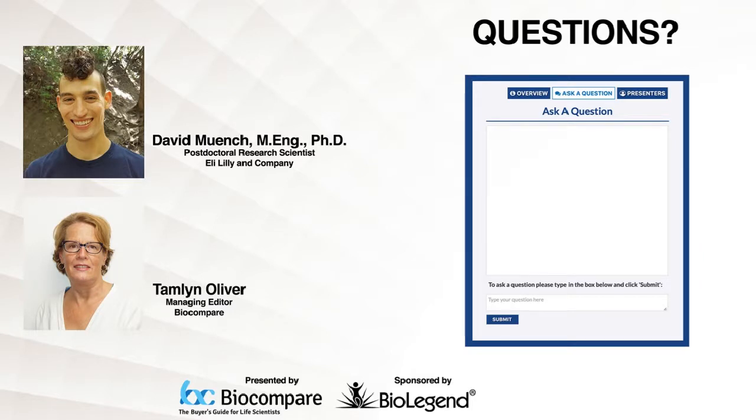Good question. So I agree that these 2 techniques are very powerful and each have their pros and cons. While single-cell RNA-seq and single-cell ATAC-Seq can be performed in parallel on individual isolated nuclei, to assess both nuclear RNA expression and chromatin accessibility, to my knowledge, there's not a current method that allows for simultaneous analysis of surface proteins by CITE-Seq as well as chromatin accessibility by ATAC-Seq. This will really be an extremely valuable tool if such a technique is developed.